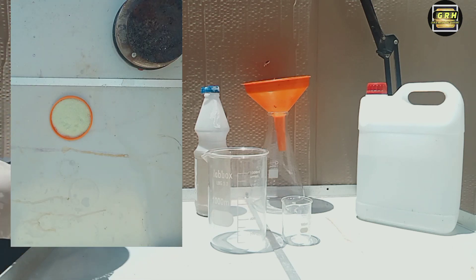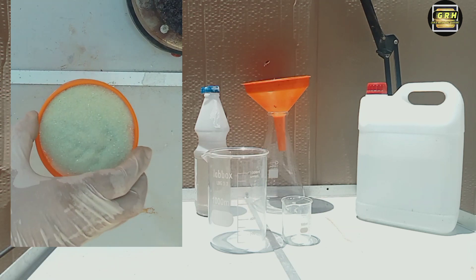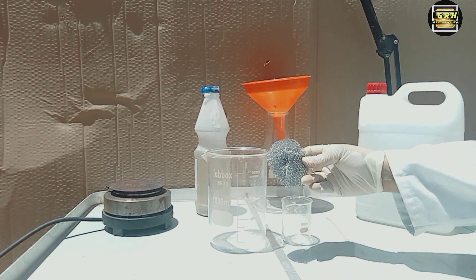Iron sulfate, also known as ferrous sulfate or copperas, is conveniently prepared in the laboratory by treating iron with dilute sulfuric acid. If you cannot obtain copperas, you can easily make it yourself.